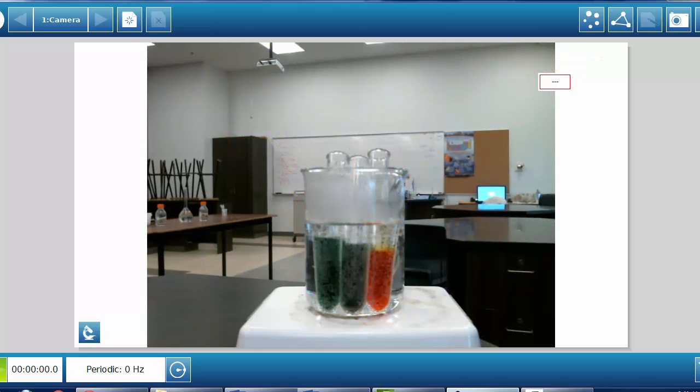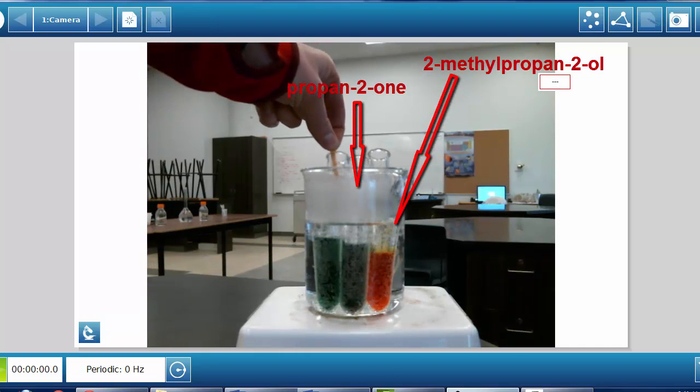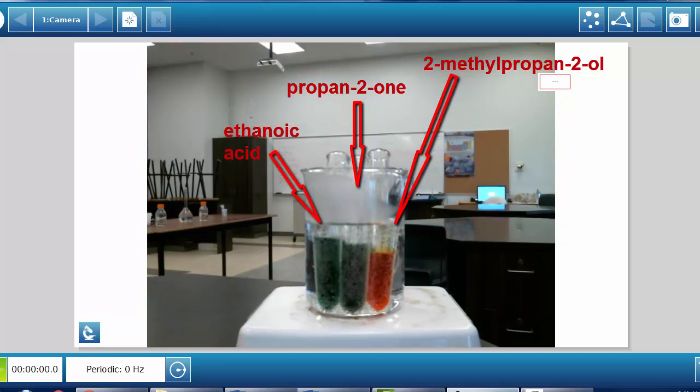All right, so I'm going to test the pH of what was ethanol. Okay, this is going to come back red on a pH strip. This is ethanoic acid now. All right, so this is the full extent of the reaction.